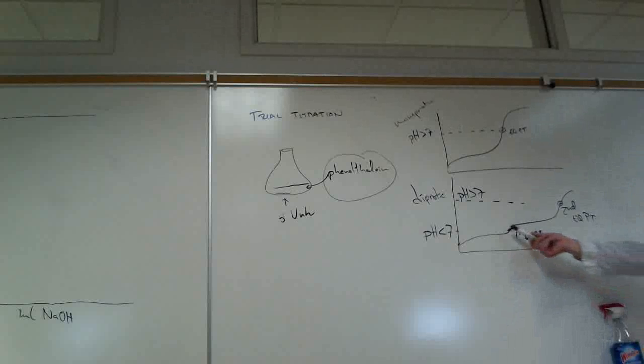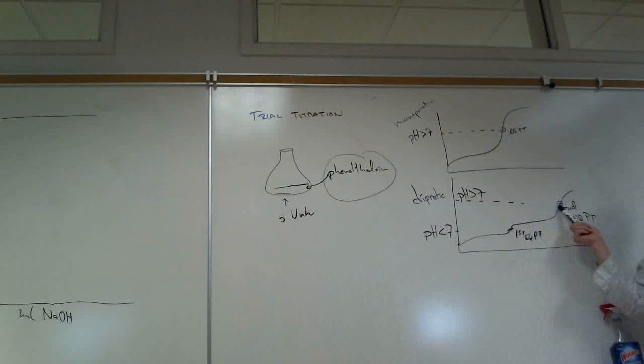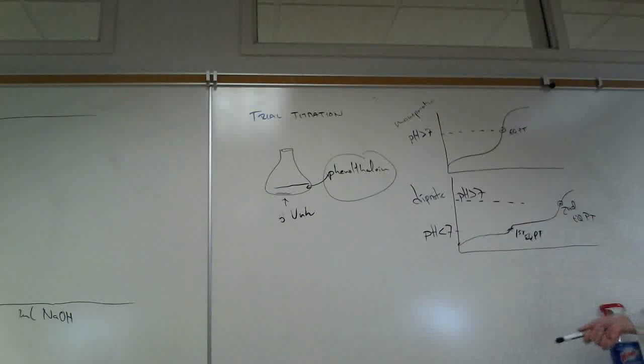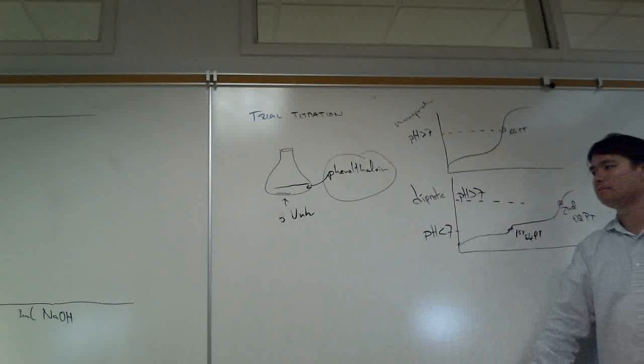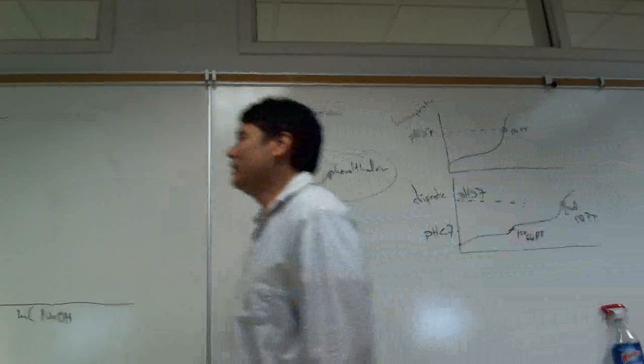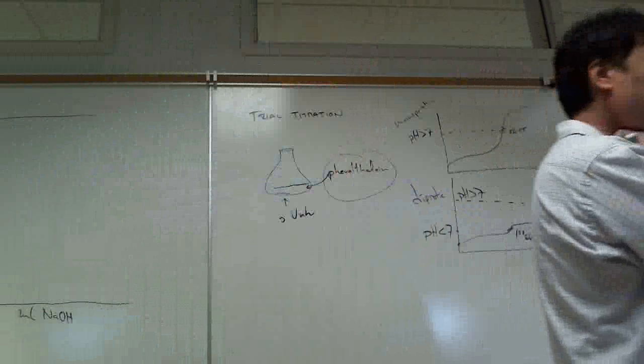So if you're titrating a diprotic acid using phenolphthalein, you never see the first equivalence point. It's going to be colorless until you hit this high enough pH, and here's where you're going to start to see pink. And so with a diprotic acid, phenolphthalein turns pink at the second equivalence point. For monoprotic acid, it turns pink at the equivalence point. Since this is an unknown acid, we don't know if it is a diprotic acid or a monoprotic acid. It can't be triprotic. We have no triprotic acid that you're going to get. And so the only two choices are monoprotic or diprotic.